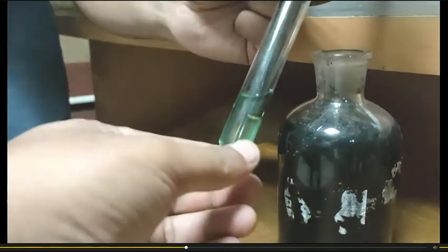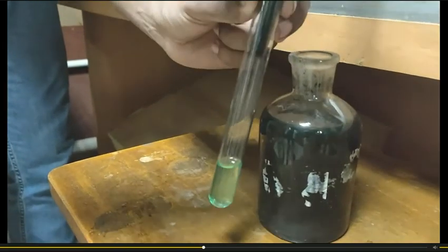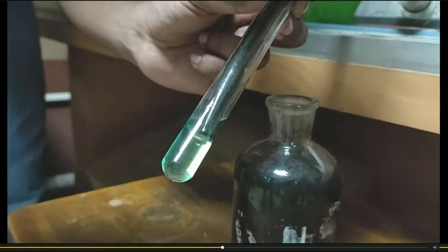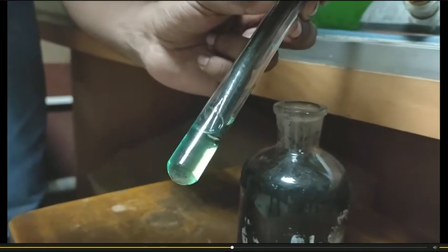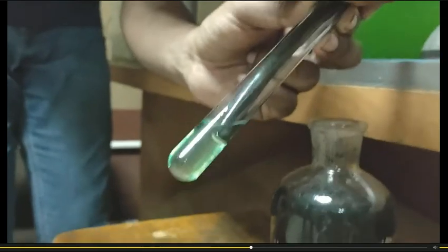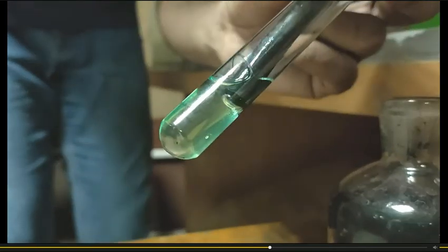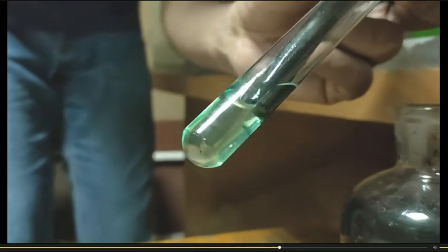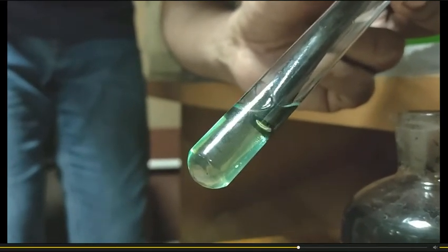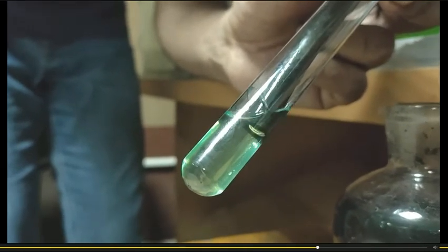Apparently there is no precipitate. The amount of gas applied to the solution should be large, so we are applying a large amount of gas. A huge amount of hydrogen sulfide gas is passing through this test tube, and there is no precipitate. This indicates that there is no presence of group 2 cations. Now we would go for the test that will confirm whether it is group 3 or group 4.